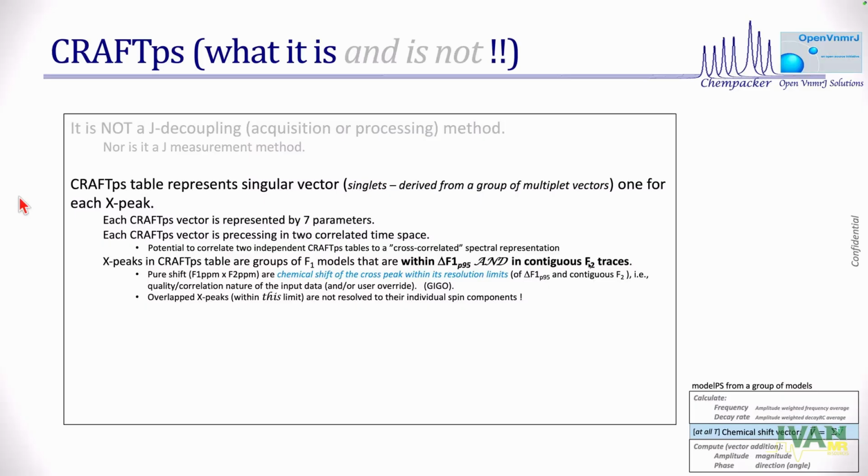But there are scenarios where you can imagine that. Let's say you have a third nucleus, F19, coupled at 150 hertz. So that's on one of the dimensions, whatever that is. Right? If you have F19, which is the third nucleus, a passive nucleus that is coupling, and it's not contiguous, so it gives you 2 cross peaks.